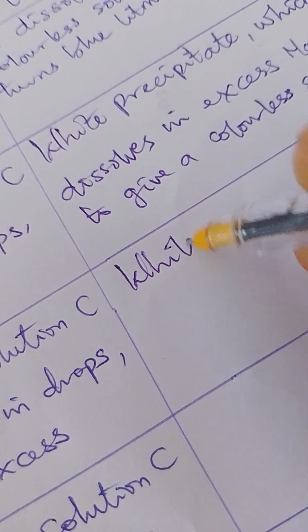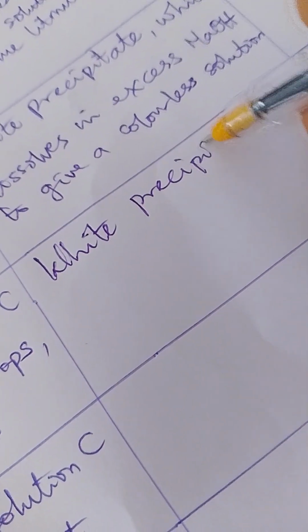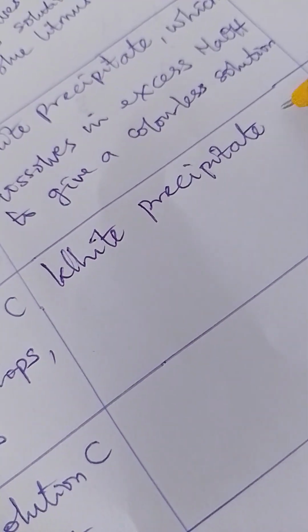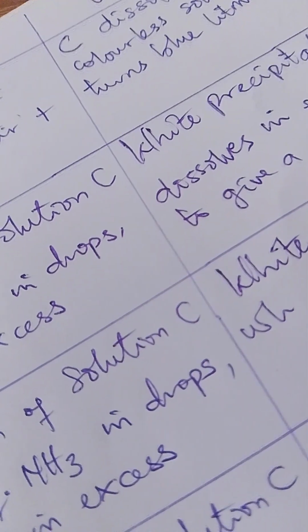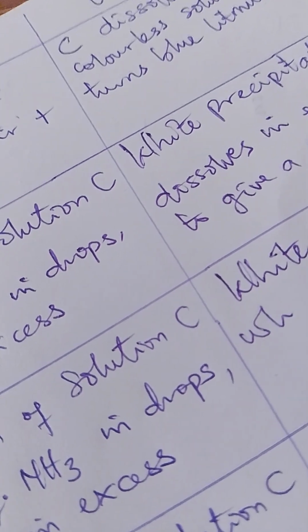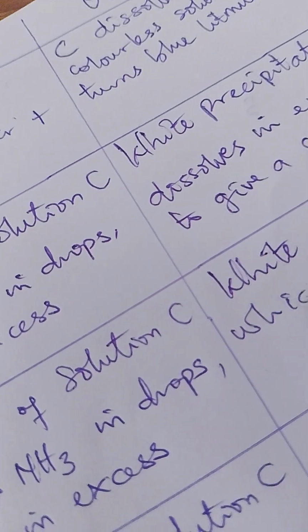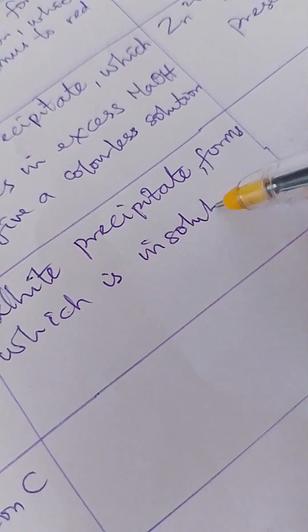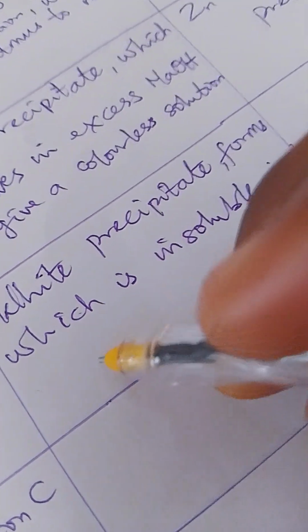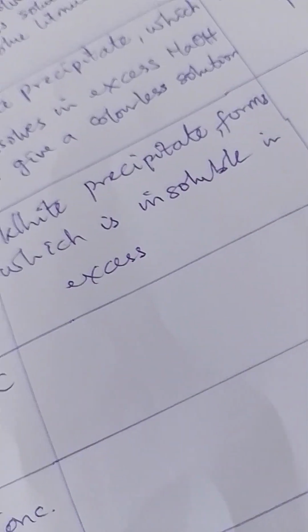So when you perform that, come under your observation and you write white precipitate forms which is insoluble in excess. Another student can just write white precipitate forms, comma, insoluble in excess. It's still the same thing.